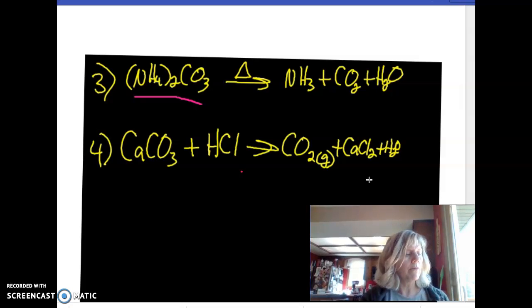Number 5 should be easy for you, I think. Number 6 is a pretty standard type of reaction that we talked about. Number 7 is as well. And number 8, remember, was burning the alcohol. Whenever we burn a hydrocarbon or an alcohol, we do a combustion reaction. We always get the same product, so you can easily reference that in your notes. Again, don't forget to classify these, and don't forget we should also be balancing these.